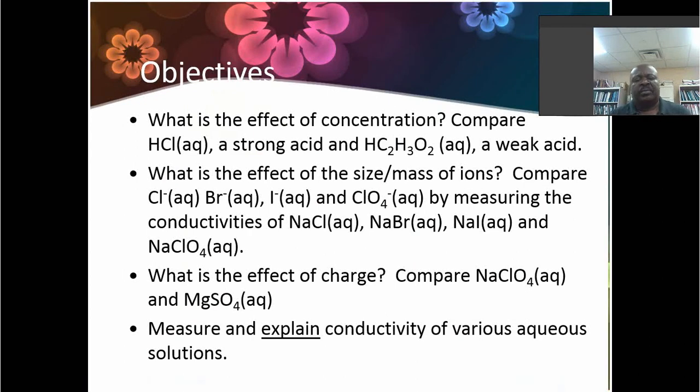Anyway, numbers are good. So we'll talk about how to measure conductivity. When I first thought about this lab, I decided, well, I've got these conductivity sensors. What am I going to do with them? I'm going to do something in 1510 Lab with them.